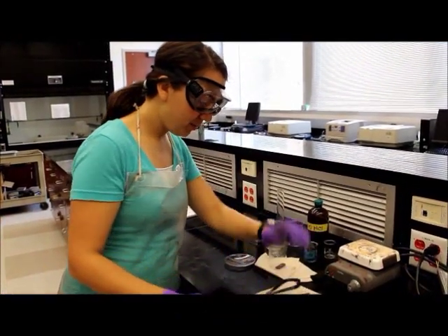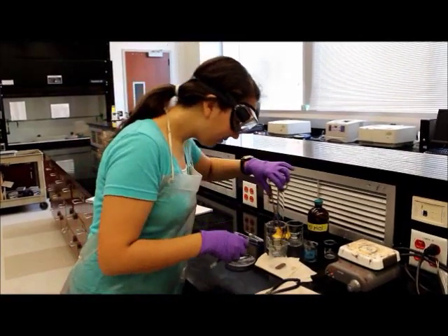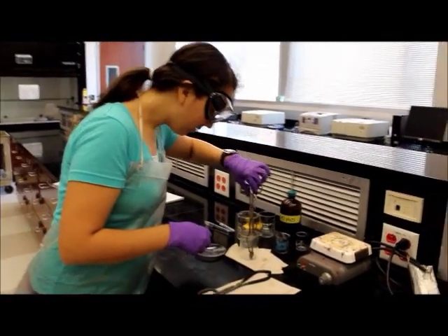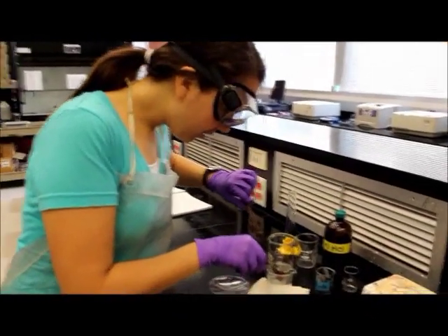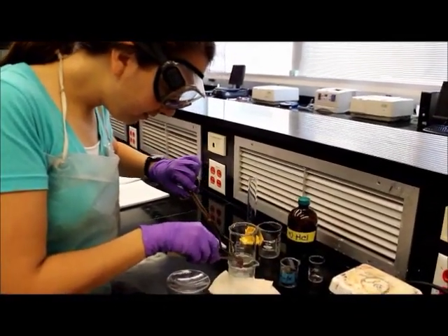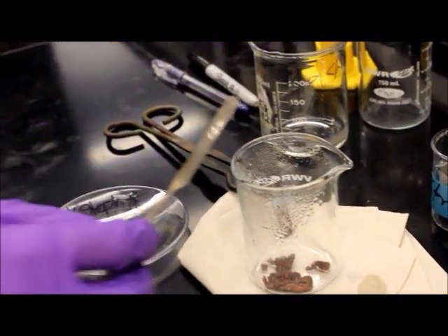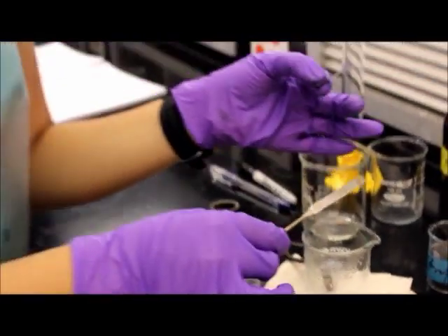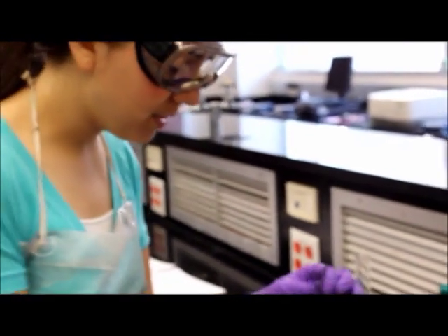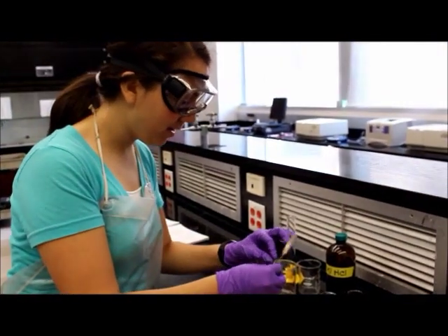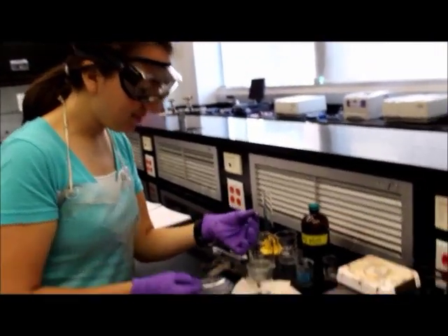Next, you will take your zinc strip and scrape off your precipitate. Just a side note, you do not want to use a rubber policeman for this because the precipitate will stick to the rubber and you'll have a really hard time getting it off.